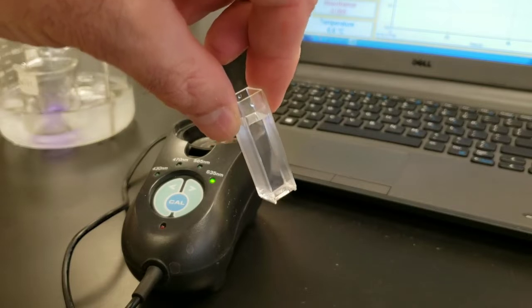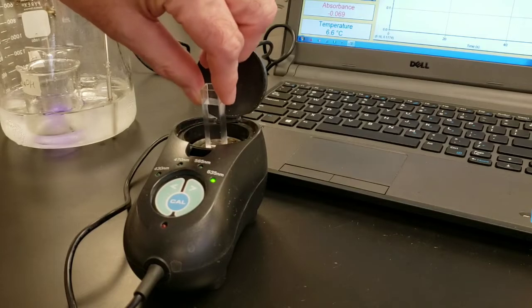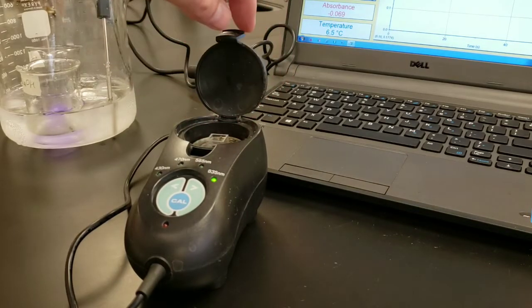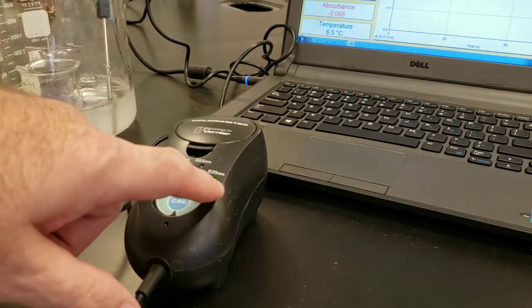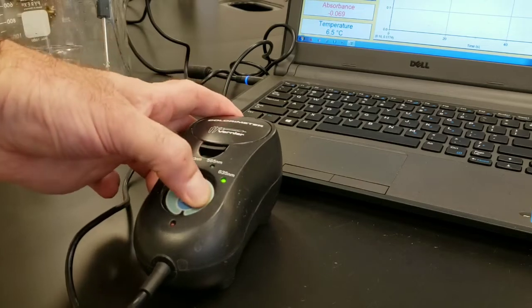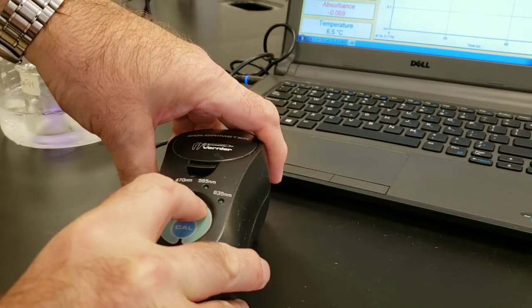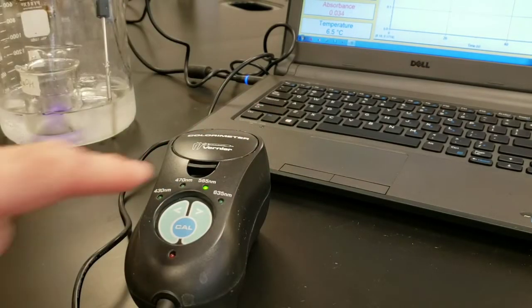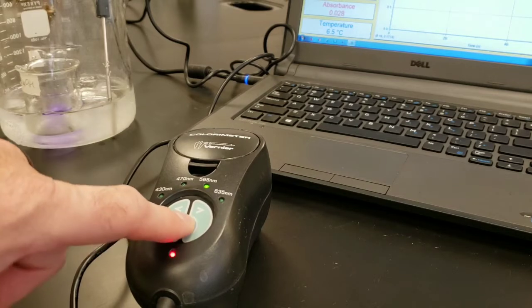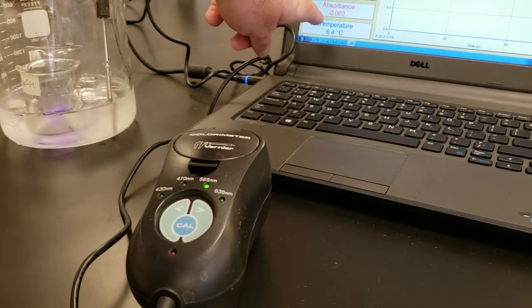Take a clean cuvette and fill it 3/4 full of distilled water. Put the cuvette into the colorimeter, close the lid. Make sure that the colorimeter is reading at 565 nanometers of wavelength, and then press the calibrate button. When the light stops flashing, the instrument is calibrated, and you'll see that the absorbance on the screen is close to 0.